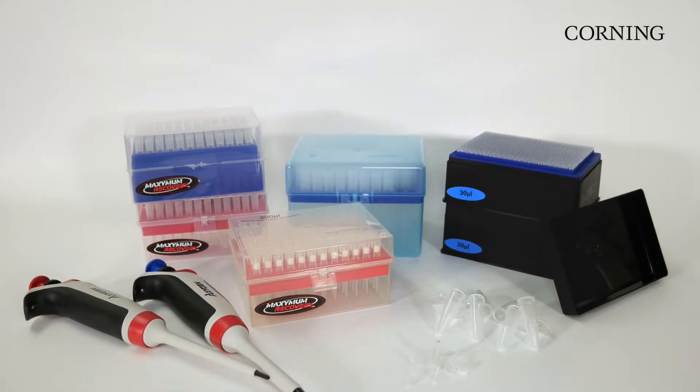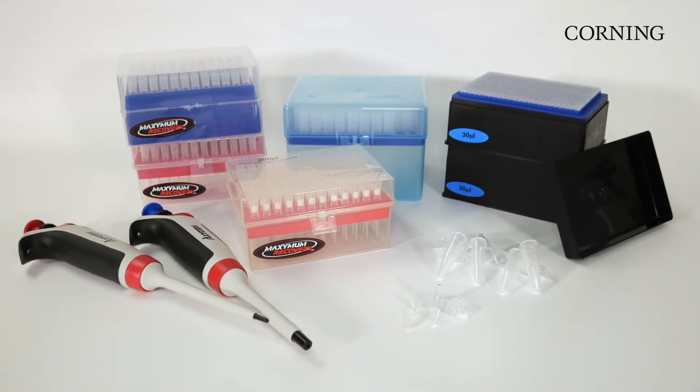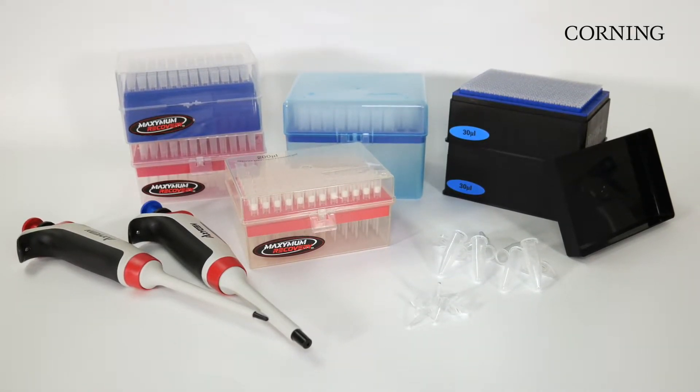Oxygen Maximum Recovery Surface is now available in a variety of product lines, including pipette tips, microcentrifuge tubes, PCR tubes, and automation tips.